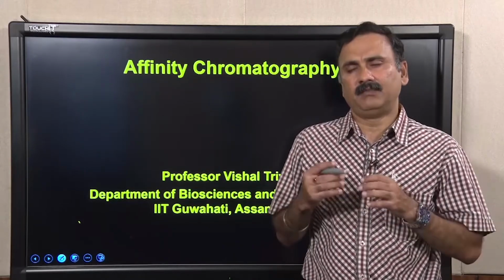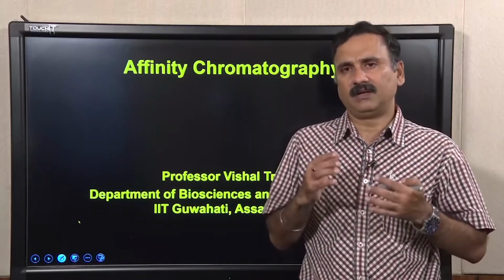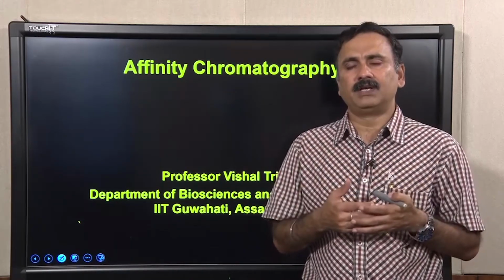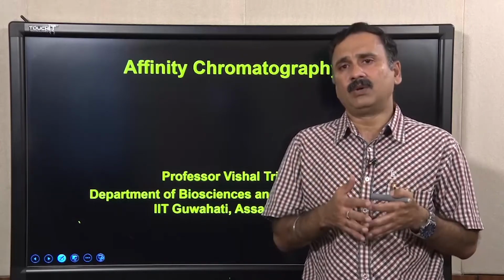In this module we were discussing affinity chromatography, and in the previous lecture we discussed the basic principle of affinity chromatography, and what determinants play a crucial role in bringing the receptor and the ligand together. We also briefly discussed the different types of matrix that you can use.